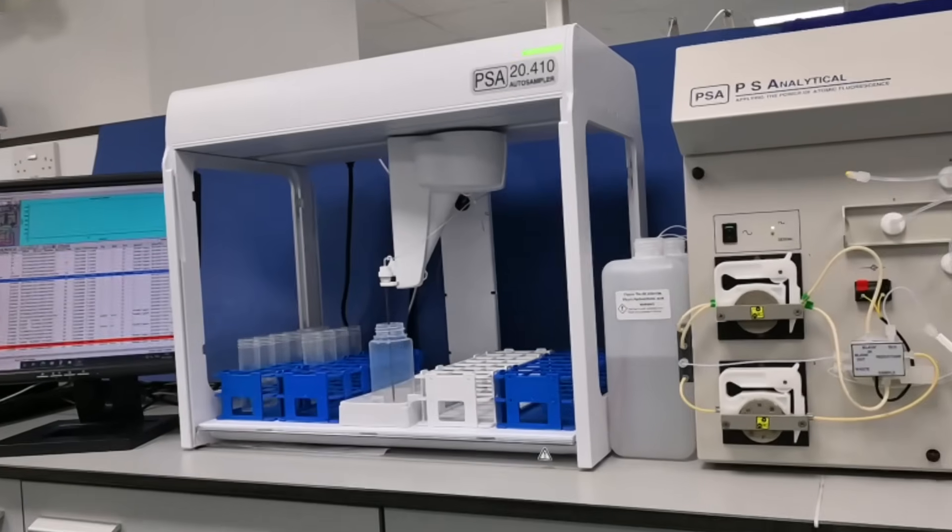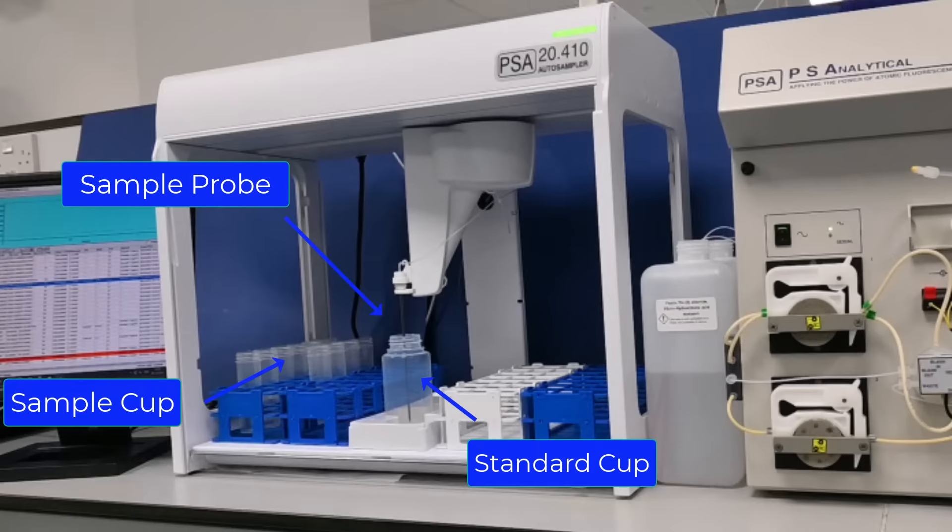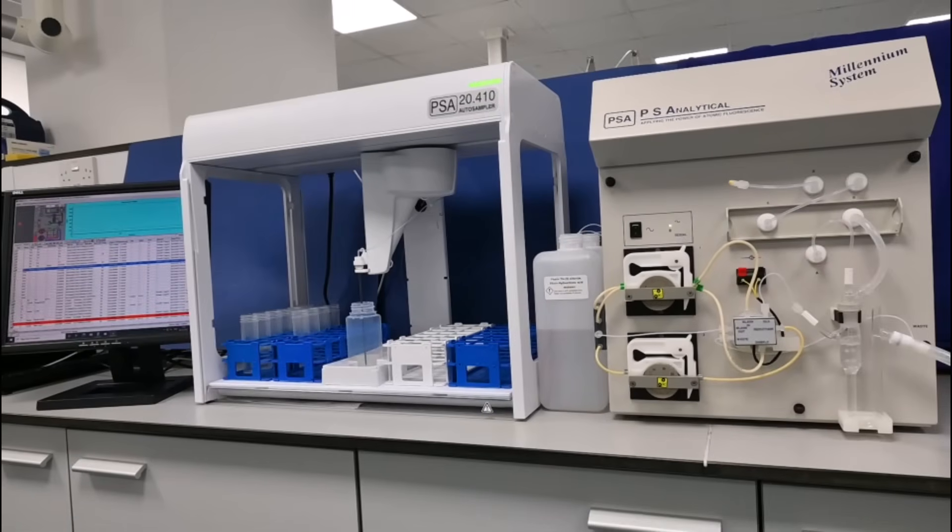When a sample is to be analyzed, the sample probe is placed into the sample vial and the instrument's analytical cycle is then commenced. During the analysis cycle, mercury vapor is purged from the gas-liquid separator through a Perma-Pure dryer system and passed over gold-platinum gauze, which subsequently collects the mercury by amalgamation.